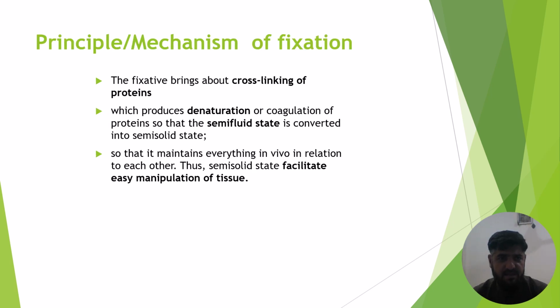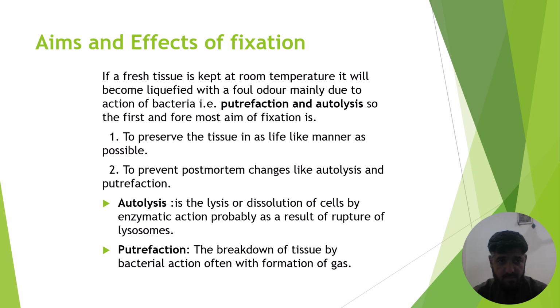So what is the mechanism of fixation or principle of fixation? A fixative brings about cross-linking of the protein, which produces denaturation and/or coagulation of protein, so that the semi-fluid state is converted into a semi-solid state to facilitate easy manipulation of the tissue. The main aims and objectives of fixation is to preserve the tissue in as lifelike manner as possible.